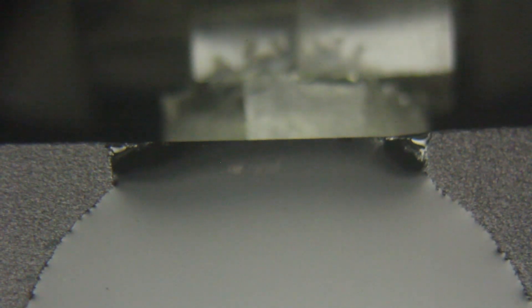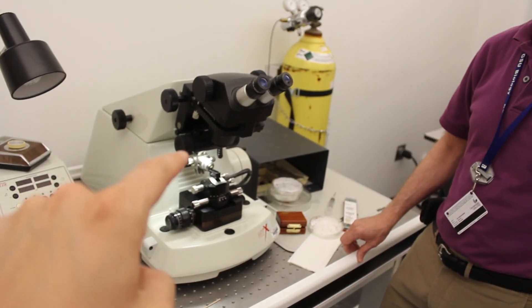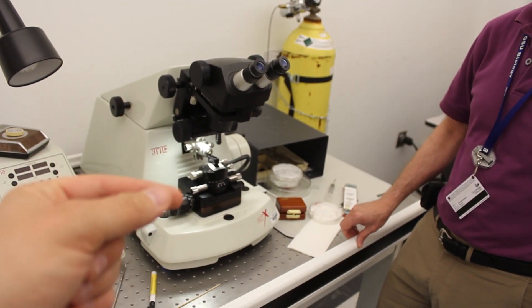Can you move the sample up and down? And you can also index the sample back and forth. So if you wanted to cut it, you would bring it towards you, right? Yes. And what's on that sample? Is that paraffin? That's plastic. That's an epoxy resin. So it's really, really hard. And that slice that we get there, we collect it, and we put it on these things here, right? The nickel grid, yeah. The nickel grid, and then we put that in the transmission electron microscope.